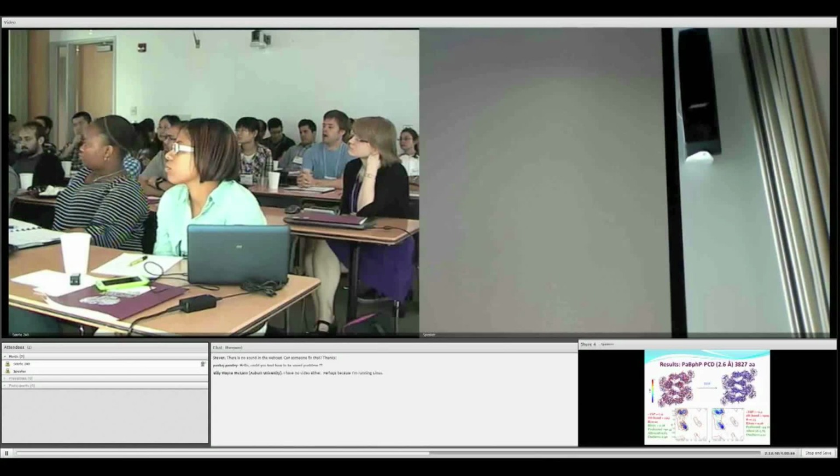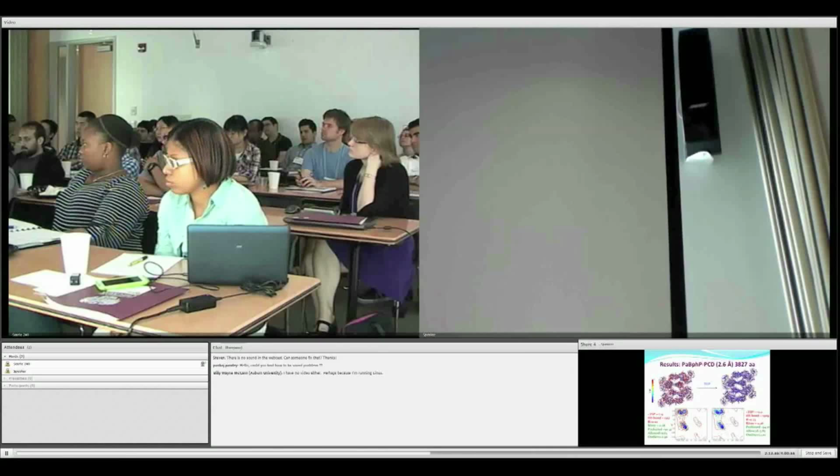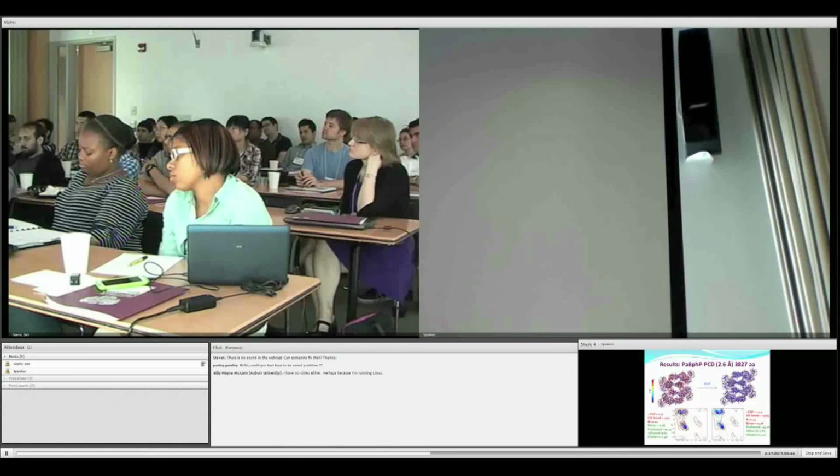And then, as I briefly mentioned, we have these R values that are very important for crystallographers. When they deposit the structure, these are checked, and they are like correlation values between the experimental data and the model they built. You can see that we almost stay the same in R, but the important thing is the R free value.